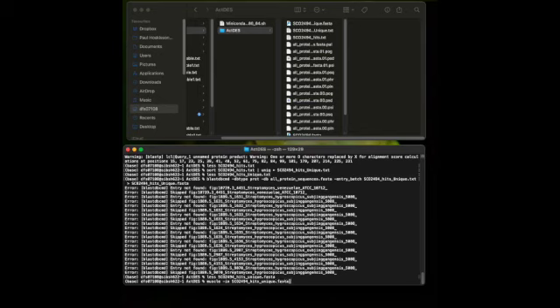dot fasta file, and then you specify your output file for the alignment to go into, and you can call this SCO 2494 alignment, and it's at this point you need to save your file as an aligned FASTA format file, so AFA file.